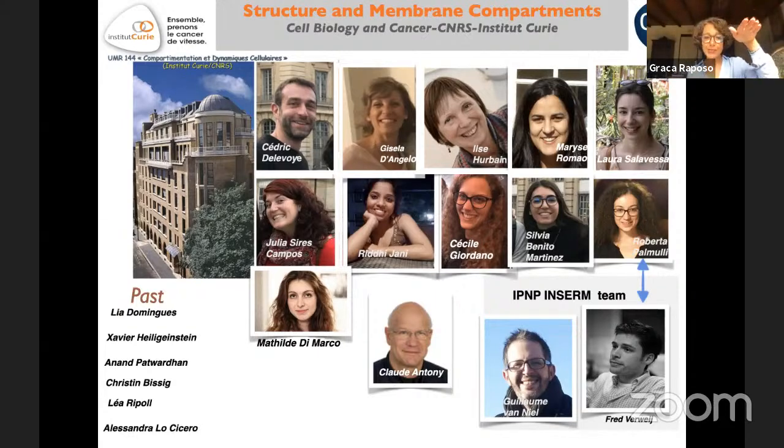There is this black book. I don't know if you remember, when we were in the EM courses, there is the magic black book of stereology in electron microscopy. I would recommend this magic black book, which is extremely old and which a lot of people forgot. I should have put also an example. There is the green book of Gareth Griffiths. Maybe I can send it to you later, because this green book is still a reference in the field of stereology in EM. But of course, it's possible, yes.